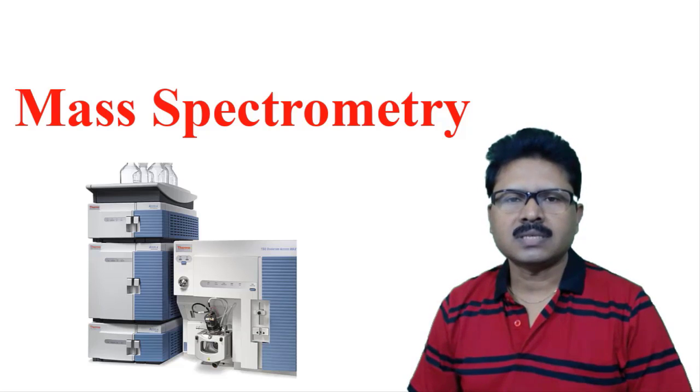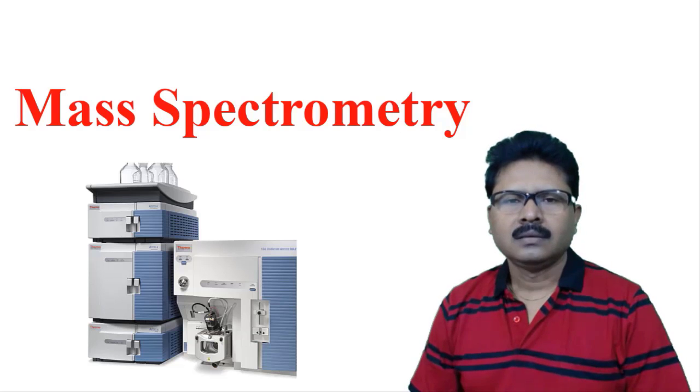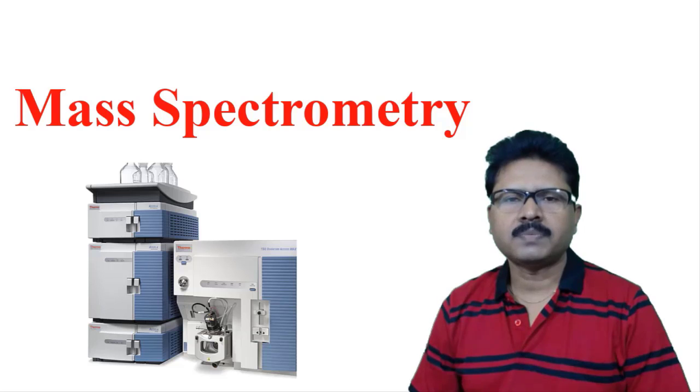Here I am going to discuss mass spectrometry. Mass spectrometry is a technique where molecules and atoms are separated with respect to their masses. So this is one of the most suitable techniques for identifying different isotopes of elements.